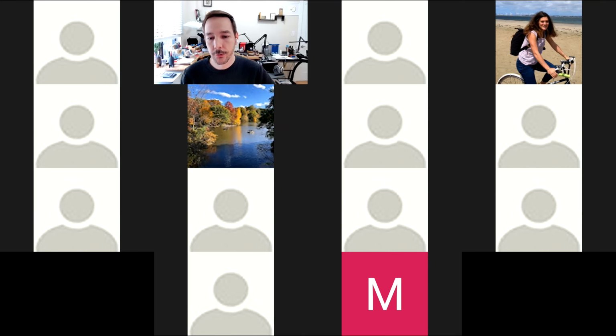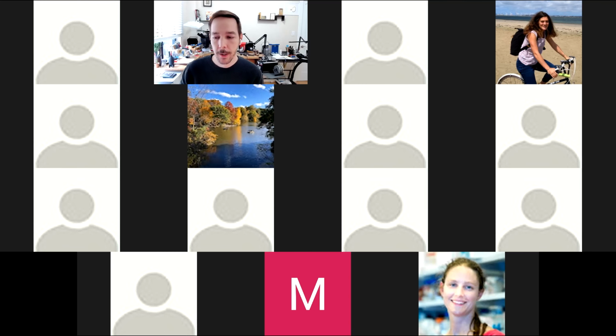I'm sure you've noticed if you try and manually count something, you should always keep a record of how you do that, ideally annotated on an image. If you come back to it the next day or a week later, you may look at it and think, oh, why did I count that? Or why did I count that in this one and didn't count a cell like that in this other image? And you'll be aware of all these sources of variability.